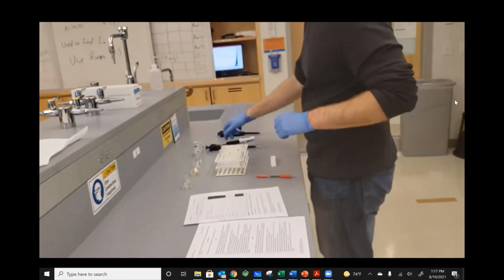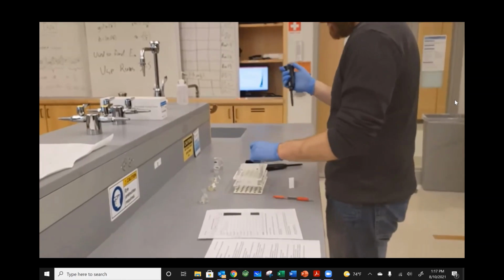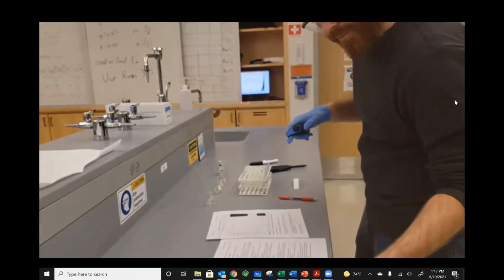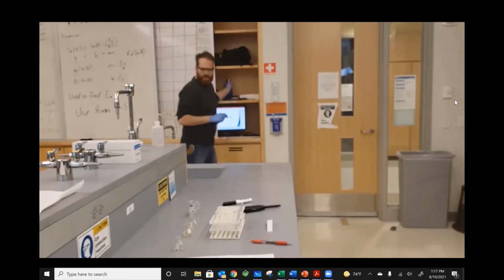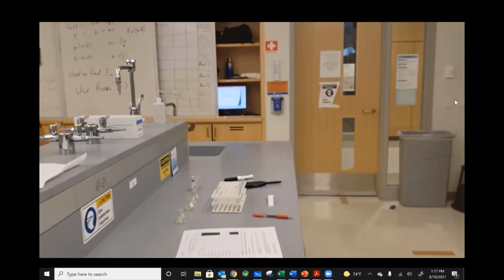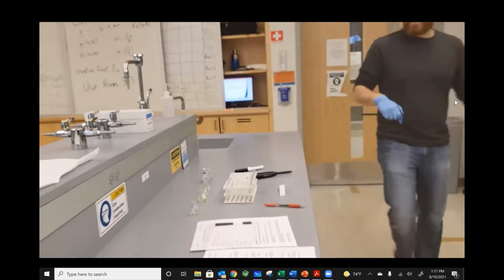All right. Moving on to run 2. This is my hydroiodic acid. This is my persulfate. Yes, it is persulfate. Excellent. All righty.